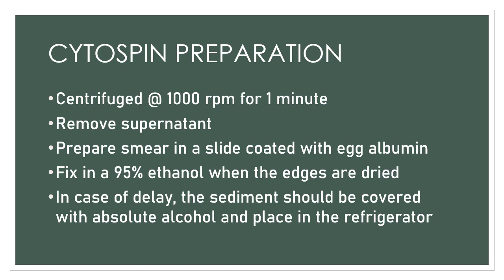Okay, and so that is your adhesive, no? And then fix in 95% ethanol when the edges are dried and the center is relatively wet.